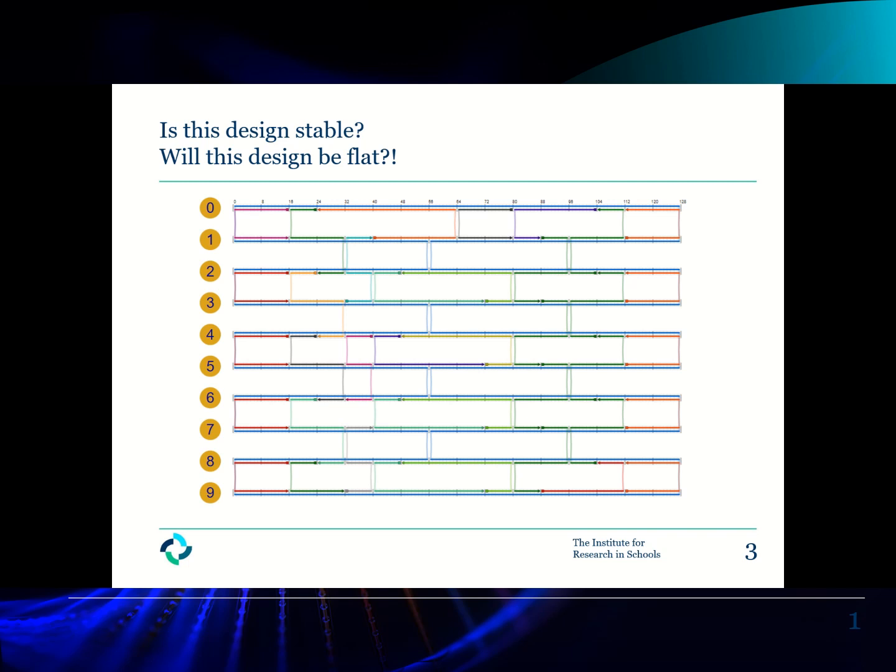Once you have generated the sequences and edited the file, it's ready to be uploaded and sent to Iris. We will send you back an image of your design and files that can be used on molecular visualization programs, of which there are several online. This is an important stage in your project as you'll be able to see how successful you have been with your designs. The analysis can be used to help you improve your designs too.